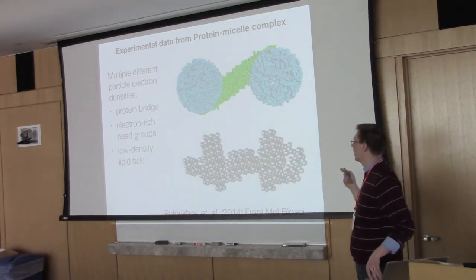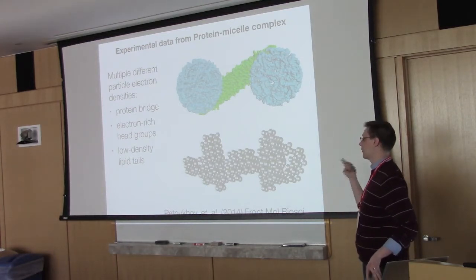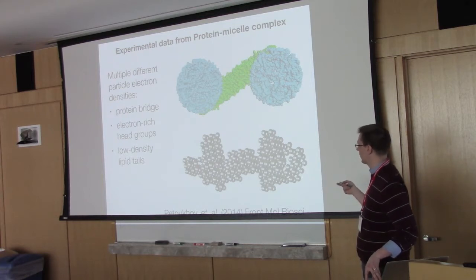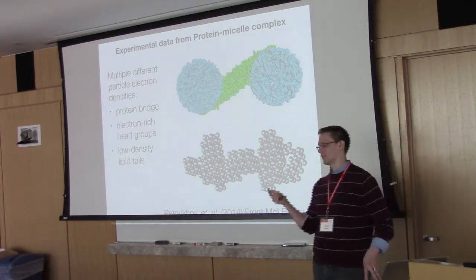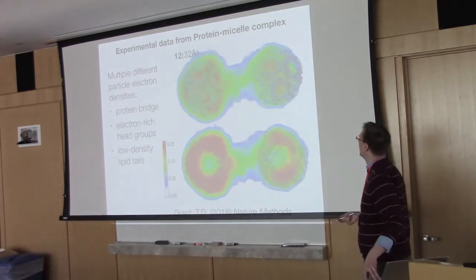Just for reference, this was the ab initio bead model that was published along with it. You can see that, for the complex shape that this object is, it's actually pretty good. The overall shape is correct. You get blobs, maybe some evidence of some internal cavity, but you can see they're not spherical. It's a good reconstruction, but we can do better.